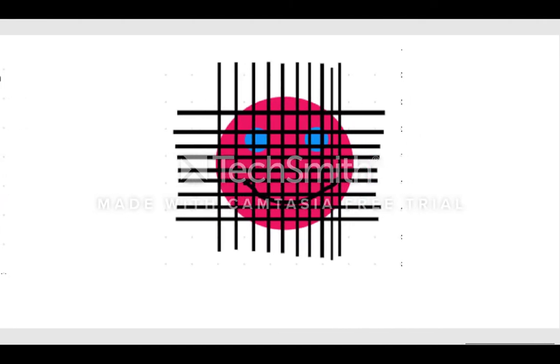Now, once it reaches the detector, which is a highly sensitive piece that collects photons emitted from a specimen, being the emission light that bounced off, starting as a light signal, it would then turn into an electrical signal that would take multiple section images, as shown here in the little squares, that the computer will then combine like a puzzle to form one sharp image of the whole specimen, being either 2 or 3D pictures.